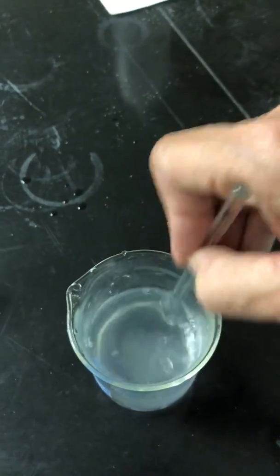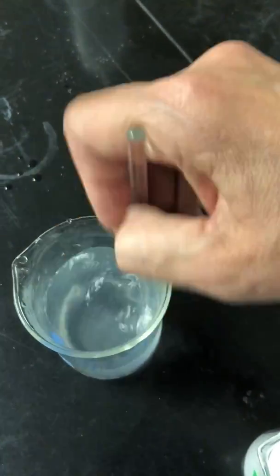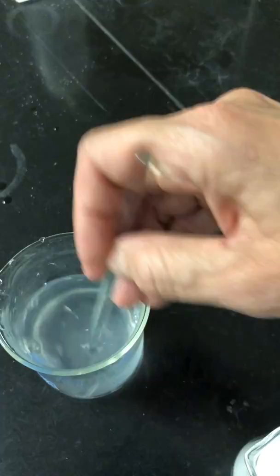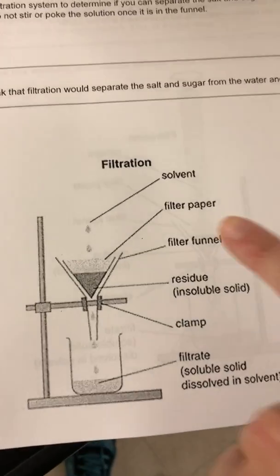So for future labs, if the instructions tell you to dissolve, you really need to be patient and do that. I had students who jumped the gun and got completely false results. All right, so we are dissolved. Now, before I pour it, I'm checking my diagram, and I am missing filter paper.